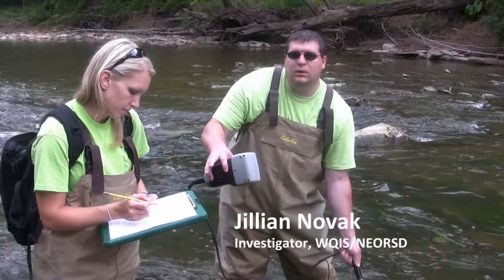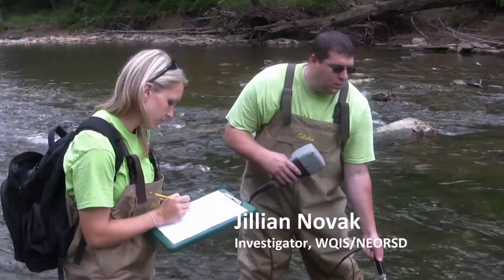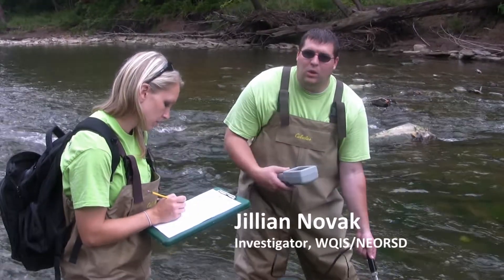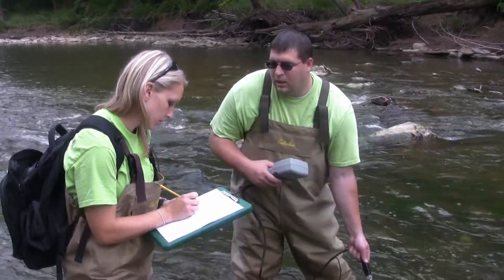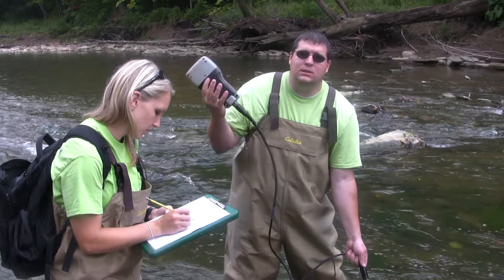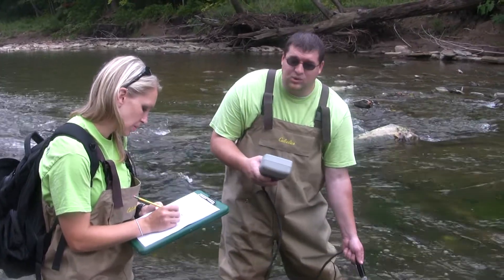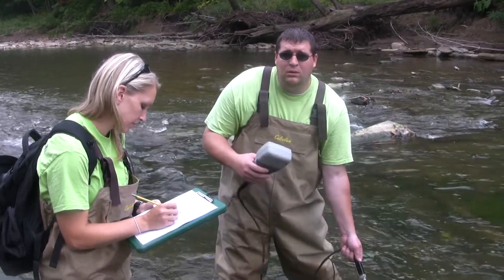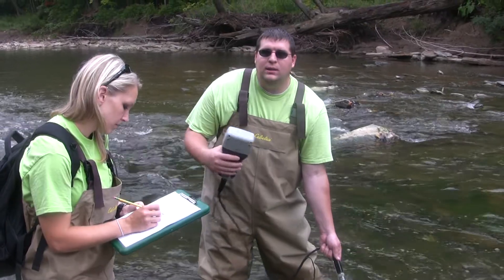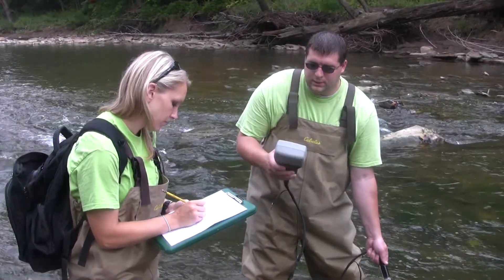What Jill's filling out here is a field sheet. It's going to record the color and the clarity of the water and even what the weather is — did it just rain, is it sunny out, has it been dry for a while? When we go to compare the data, we'll have a good idea of what was going on that day when we were collecting the sample.